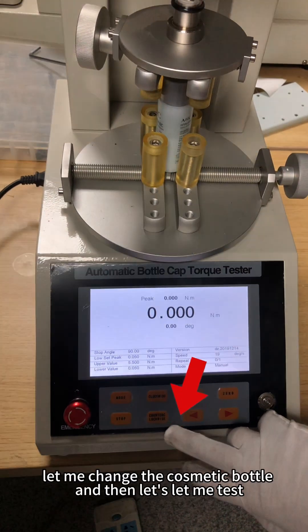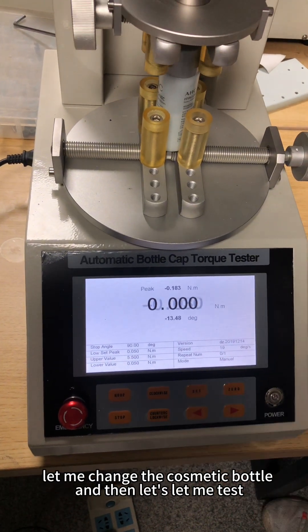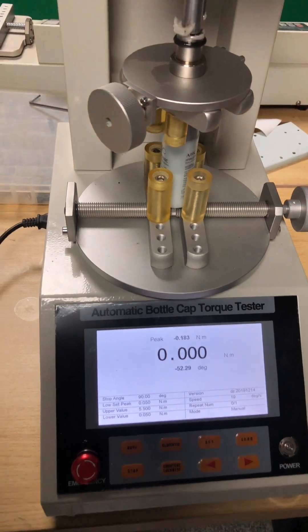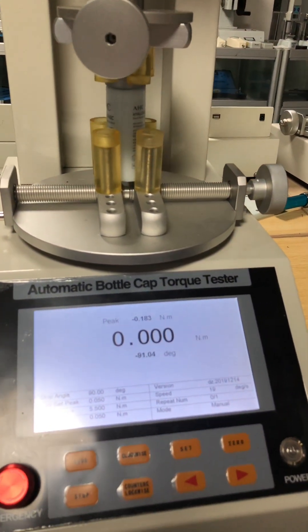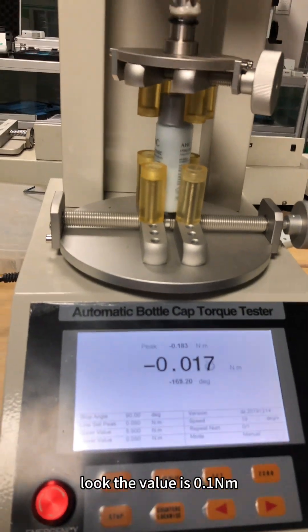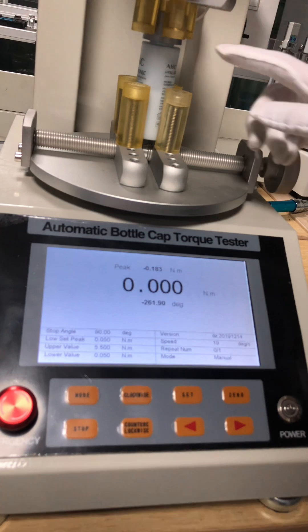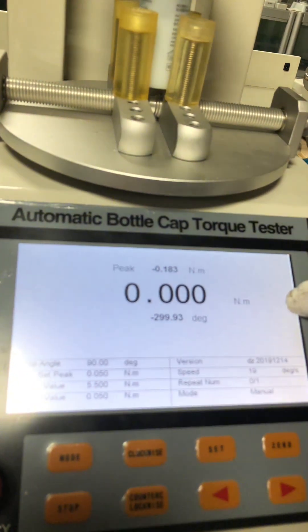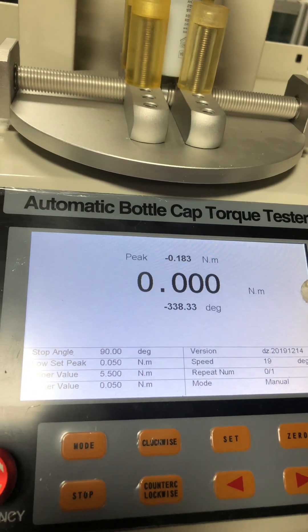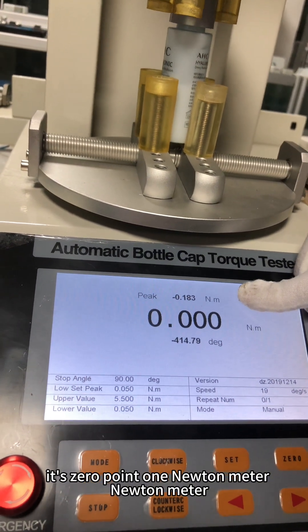Now let me change to the cosmetic bottle and test it. The value is very small — it's 0.1 Newton-meter.